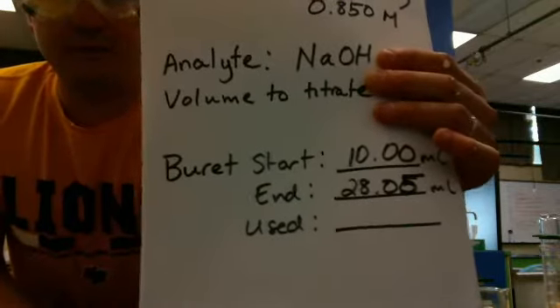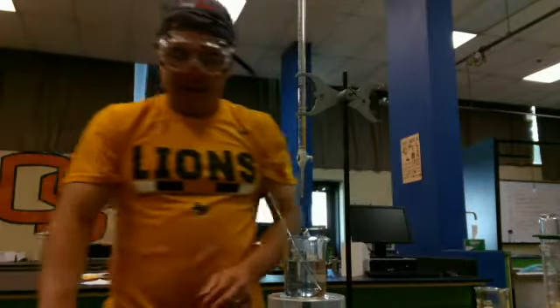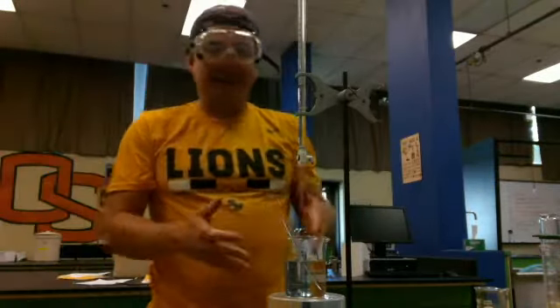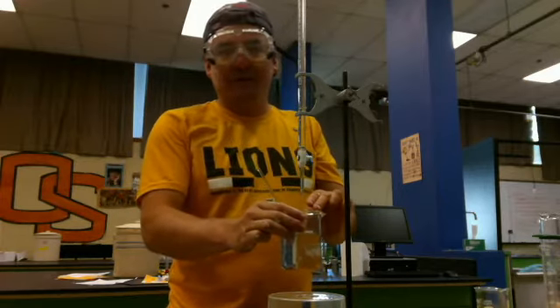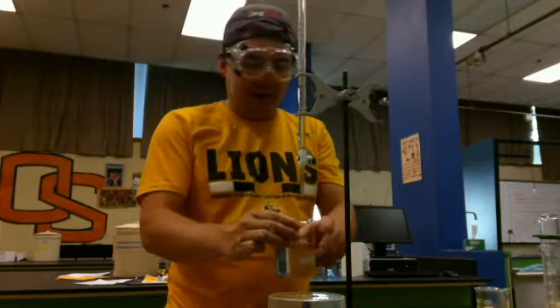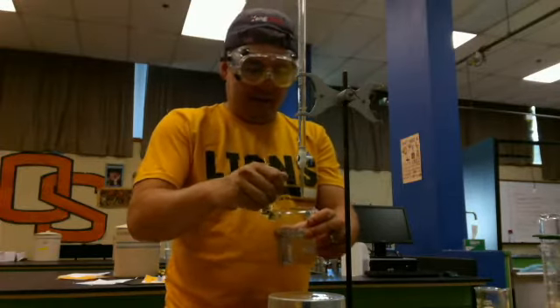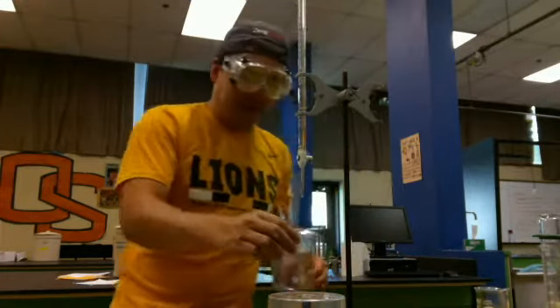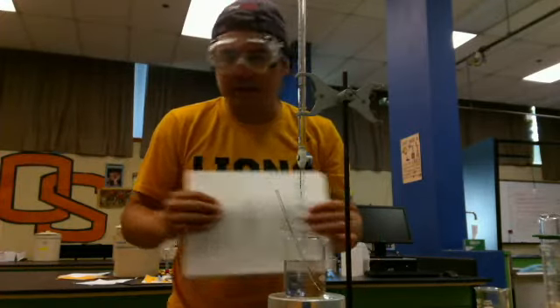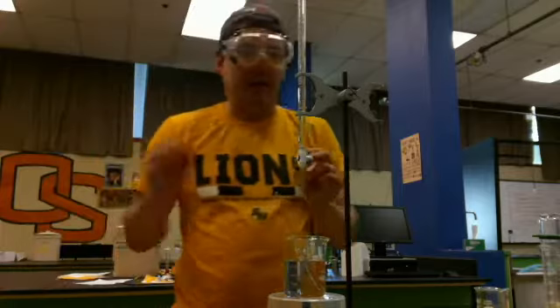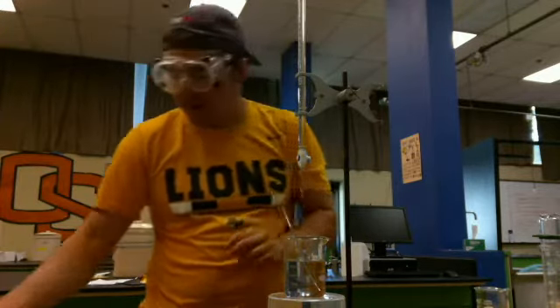That's hard to read. 28.05. But I'm going to note that that's just where it went clear, and I'm going to see if I can get it pink. Now, I don't know what this scale, and my cabbage juice was a little old because my cabbage had sat unrefrigerated. So I don't know if it's going to turn pink, but I know that my end point was right now at 28.05, and I'll just add a little more. Oh, yes. I can see a very, this is very, very pink. This is a light pink color. It's very light pink.